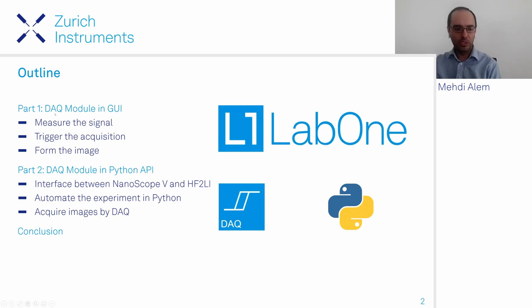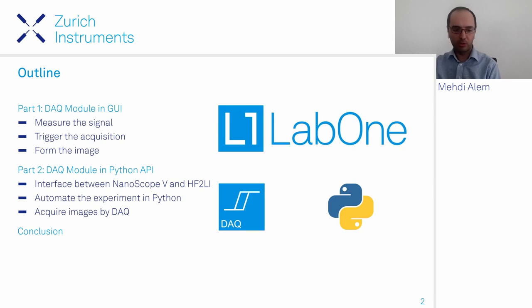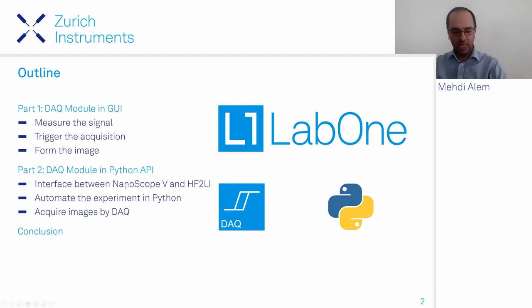In the next half hour, first I will show you the module in the graphical user interface where you can measure and demodulate the signal, trigger the acquisition of data, and make images. Then we will move to Lyon, France, where the same measurement is done in a real lab environment with a microscope using our Python API instead of the GUI to automate the measurement. Then we conclude this tutorial. Let's jump to the LabOne user interface and start a simple measurement.